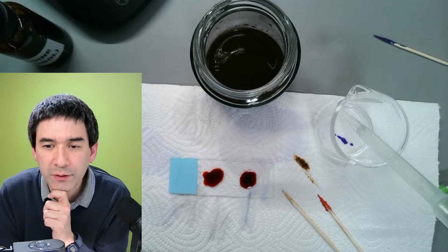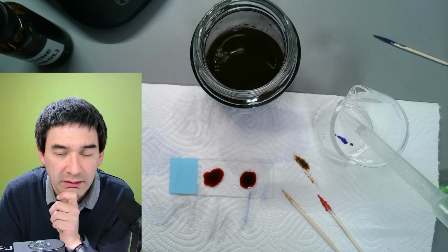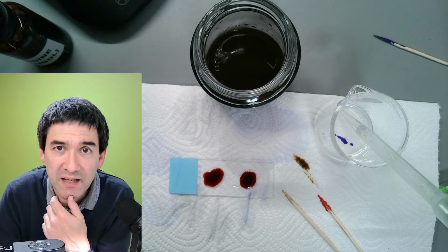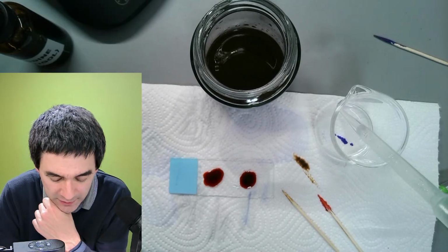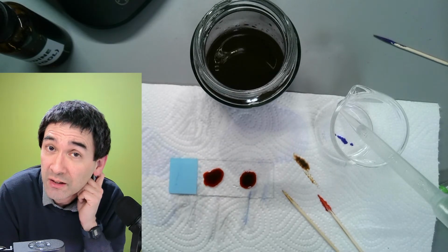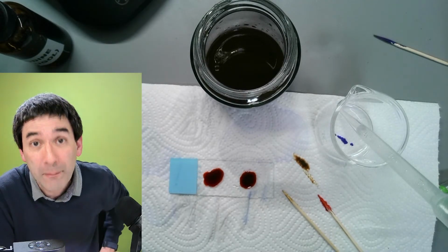If you're pressed for time, you can always do this as a short or a mini video later. Yes, I definitely intend to do that, because there have already been several requests for Gram staining demonstrations, and I think a full hour just on that detail might not be necessary in any case. I want to use yogurt bacteria, because yogurt bacteria are also Gram positive.